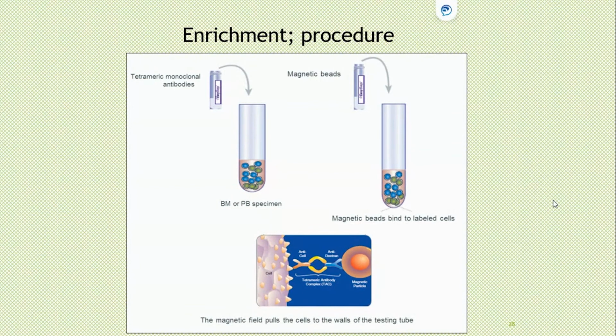That monoclonal antibody you add to the mix, and you also add some magnetic beads to the mix. And now you have this picture at the bottom. You have the cell with the antigens on the top. The monoclonal antibody attaches to that CD38, but at the other end attaches to the magnetic bead. Now, if you pull the cells through a magnetic field, all these beads will attach to the inner surface of the field, and the rest of the cells go out. So in this way, you actually handpick your cells of interest, attached to the wall of the magnetic field.